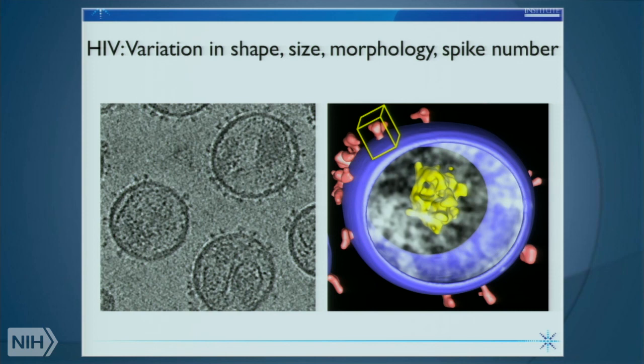And the central focus of what we did was to take on what seemed at that time an intractable problem, which was to determine the structures of proteins on the surface of viruses capable of infecting cells, but where every single variant was slightly differently shaped, with different structures and different numbers of these envelope glycoproteins that you see boxed on the right-hand side.